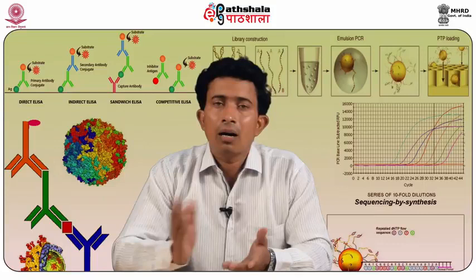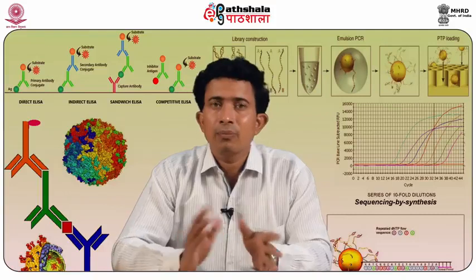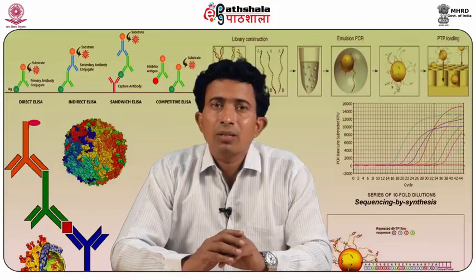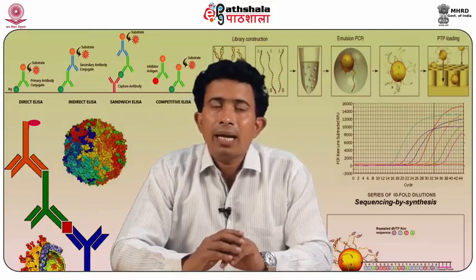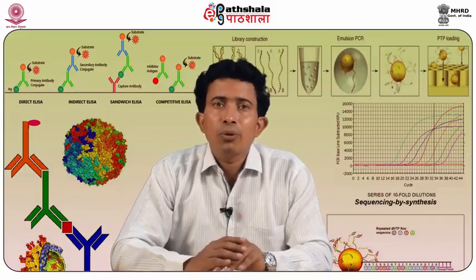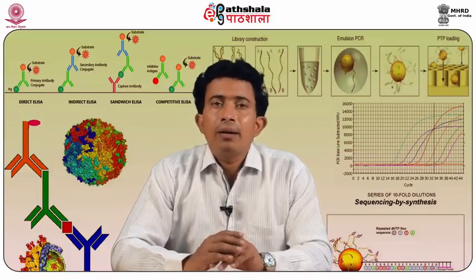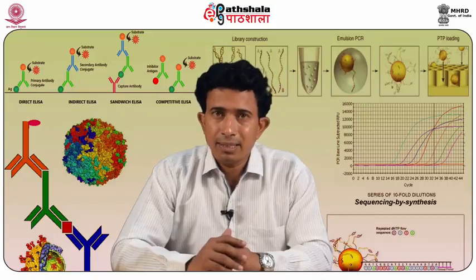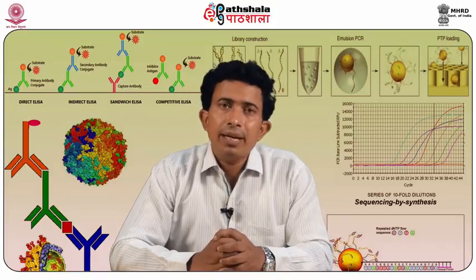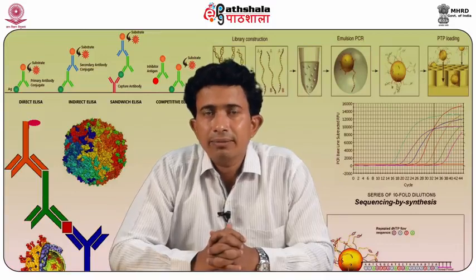These methods are relatively quicker, less time consuming, and less costly as compared to the first generation methods. Now people are going for third generation methods, which are in an active state of development, and these include single molecule sequencing and single molecule real-time sequencing, microscope based sequencing, and MALDI-TOF MS based sequencing. So these three generations of sequencing have provided us a valuable tool, that is DNA sequencing.